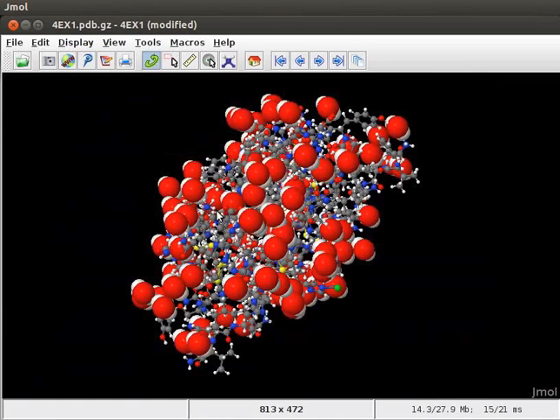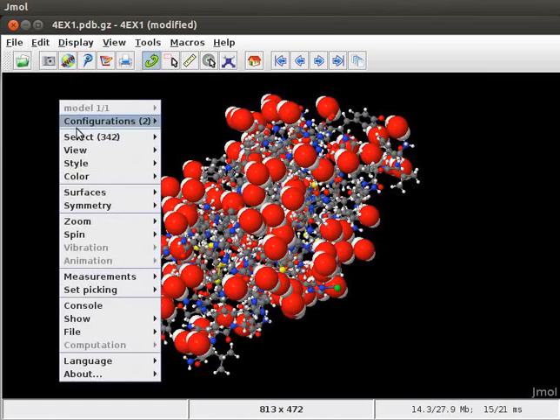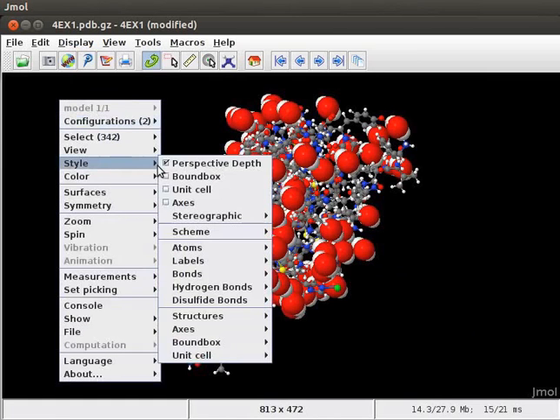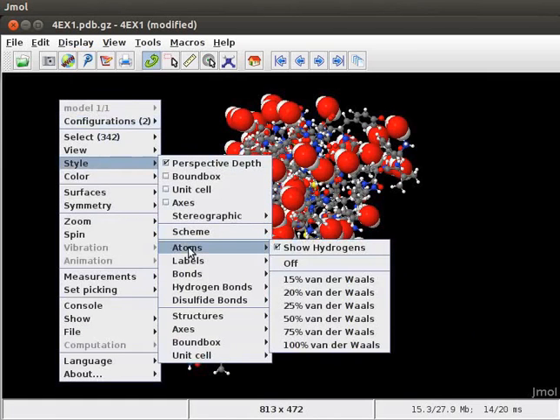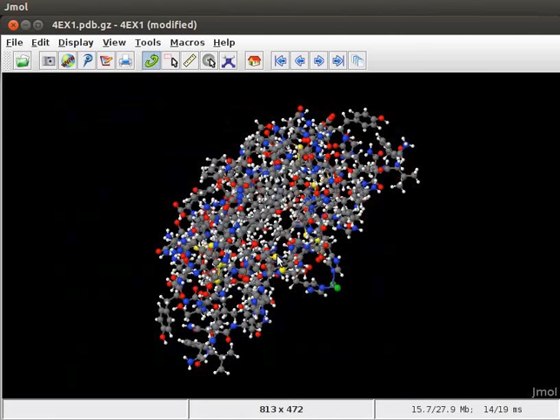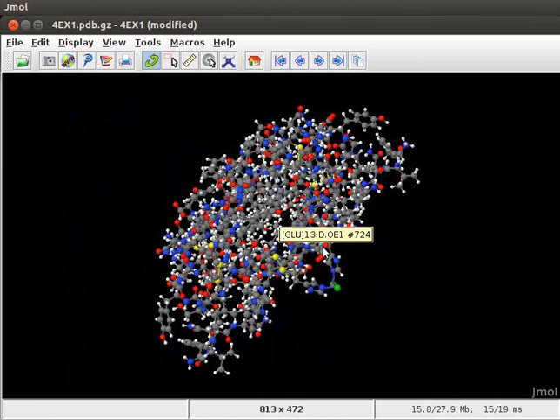Open the pop-up menu again. Go to Style. Scroll down to Atoms and click on Off option. Now, on the panel, we have insulin structure without any water molecules.